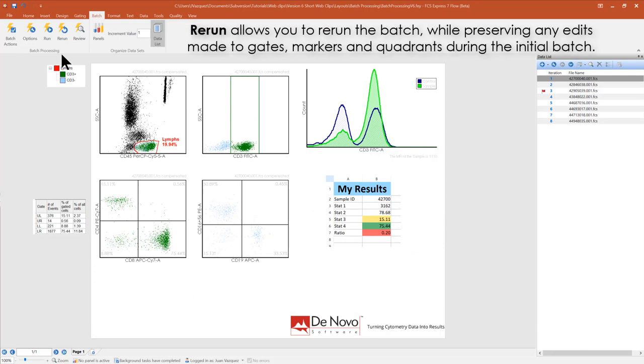Rerun allows you to rerun the batch while preserving any edits made to gates, markers, and quadrants during the initial batch.